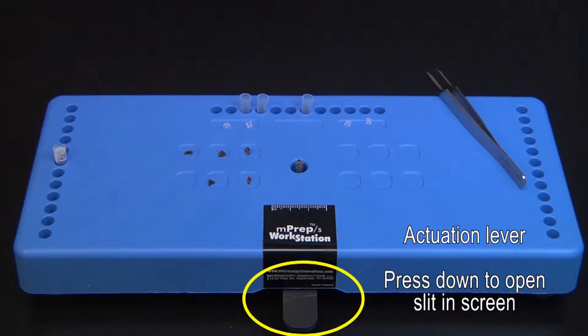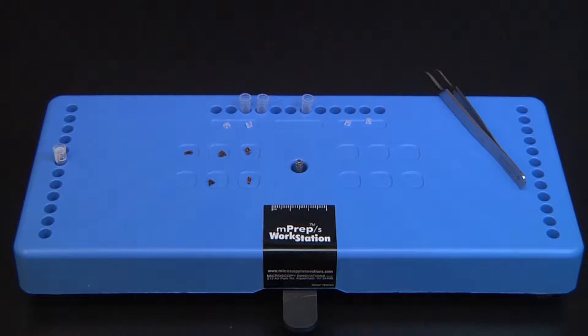At the front of the workstation is the actuation lever. This lever opens a slit in the MPREP-S screen to pinch mount and orient specimens.